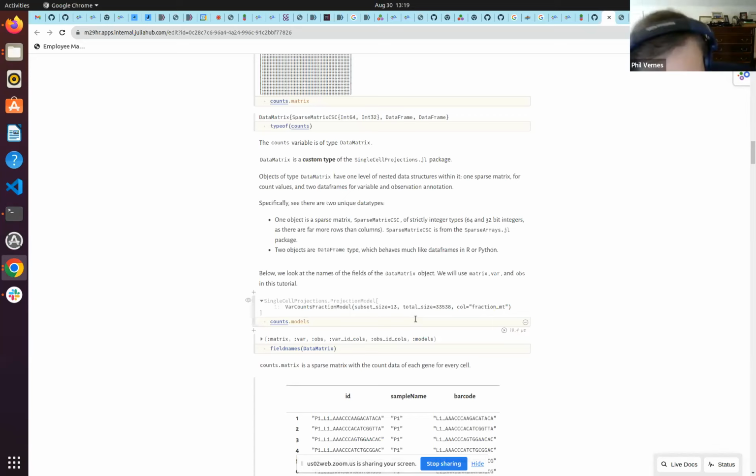One of the advantages is that I don't need to store it in a new variable. I don't necessarily need to rerun the process. I don't need to have multiple objects in memory. Part of what motivated this models field was the concern that, as you work through the sequencing process, you would have progressive development of several hierarchical, nested data frame type things sitting in memory, taking up a lot of space, and that's not good.